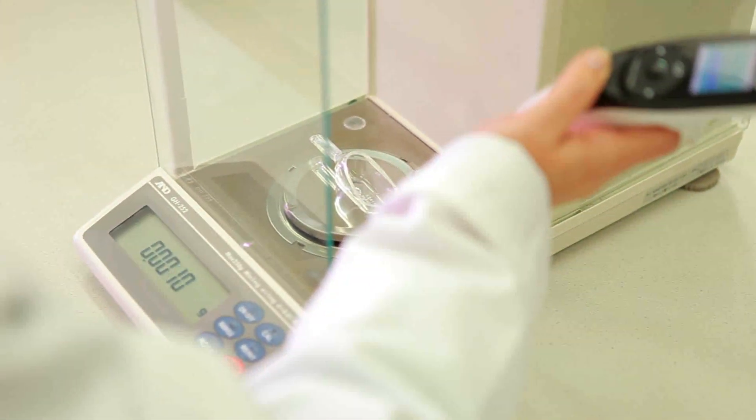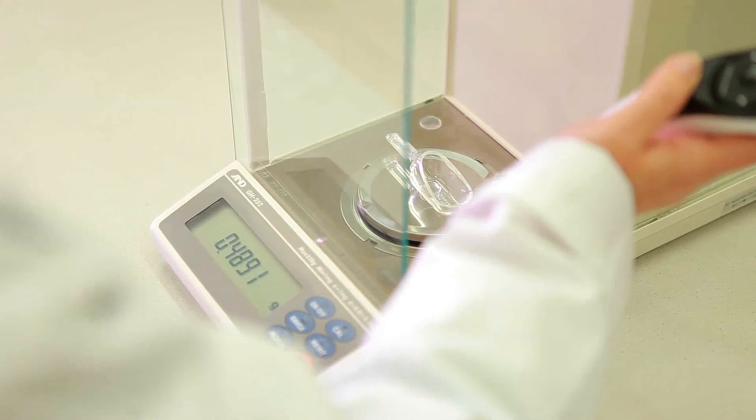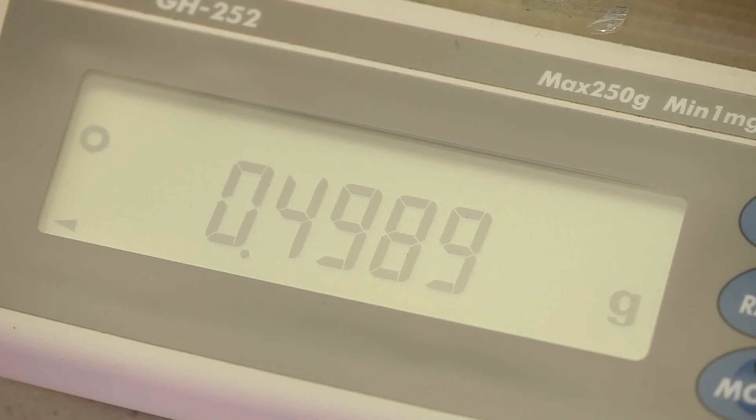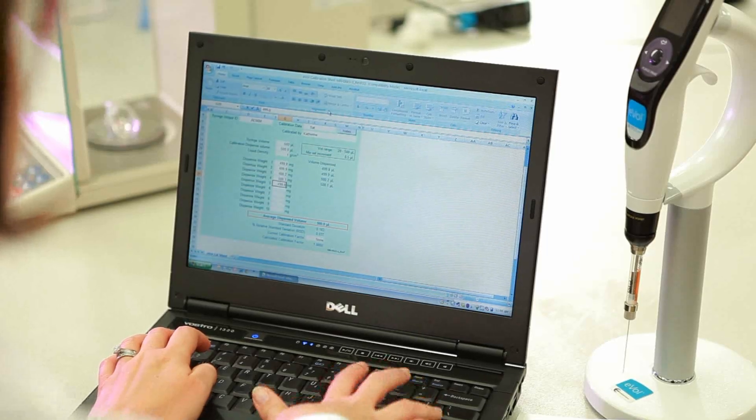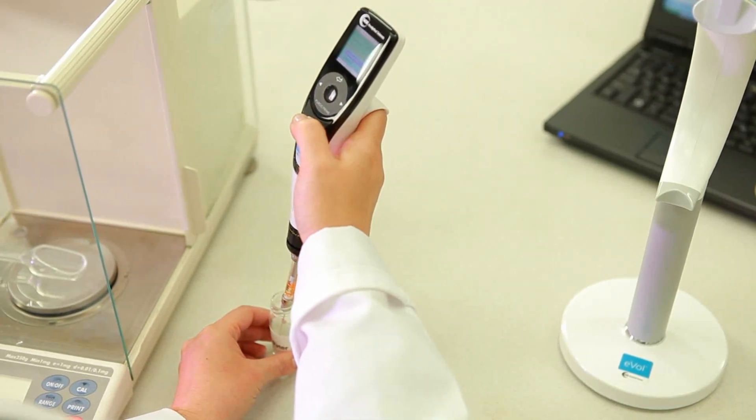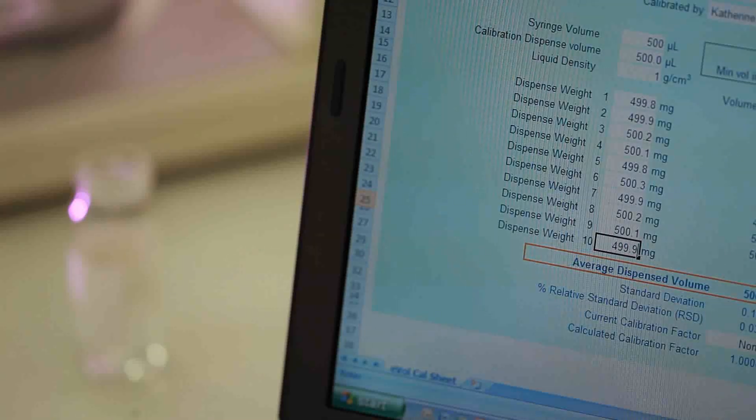Dispense the liquid into a weighing container on a balance capable of weighing the dispensed liquid to at least 4 decimal places. Record the weight of the calibration liquid from the balance and input the weight into the worksheet. Repeat this 10 times and enter the average dispensed volume from the worksheet into your EVOL to enable the calculation of the calibration factor.